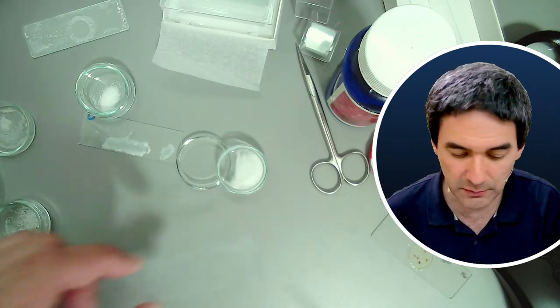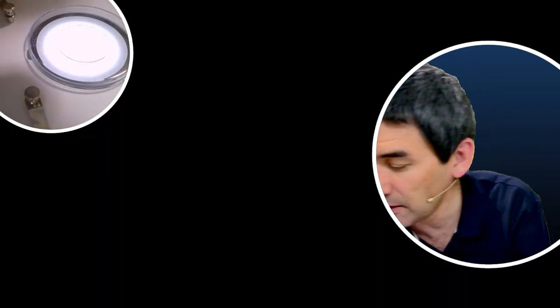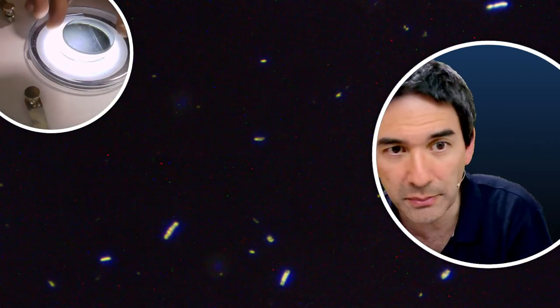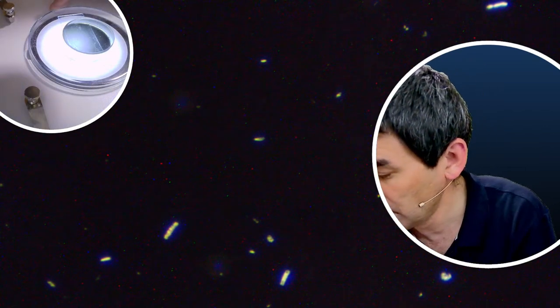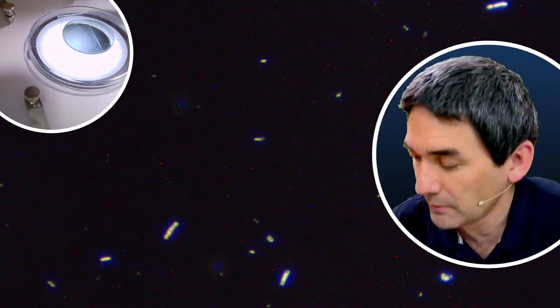Okay, so let me quickly put it under the microscope again. I have to change over, deactivate and activate. Let's put it here. This one goes on top. I'm going to rotate it until it's black. And we're just going to wait, I guess. Maybe after a minute or so, we're able to see again the crystals forming.